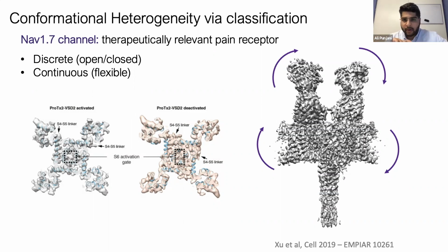The reason is that the particles have to have their alignments. And if the particles already have their alignments, we can actually do a reconstruction with all the particles without having the initial volume to start with, or the volume from refinement to start with. So it's actually easier and cleaner. And the way it's implemented is that you connect all the particles and the particles have their alignments. The first thing 3D variability does is reconstruct the consensus refinement from all the particles and their fixed alignments, and then carry on with 3D variability analysis with the mask that you provided.